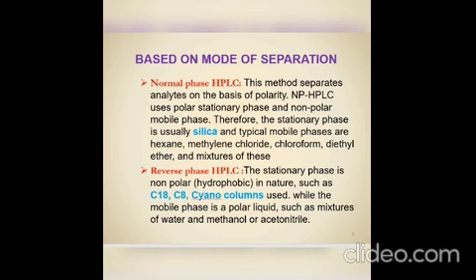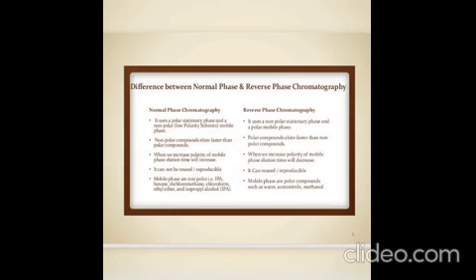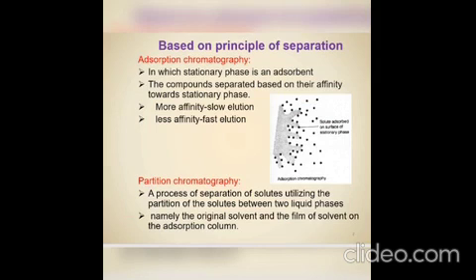These are some differences between reverse phase chromatography and normal phase chromatography. The next one is based on principle of separation. There are 2 principles in chromatography, not in HPLC specifically: adsorption and partition. Adsorption means the separation takes place between a solid and a liquid, which is known as adsorption chromatography. If the separation takes place between 2 liquids, it is known as partition chromatography.